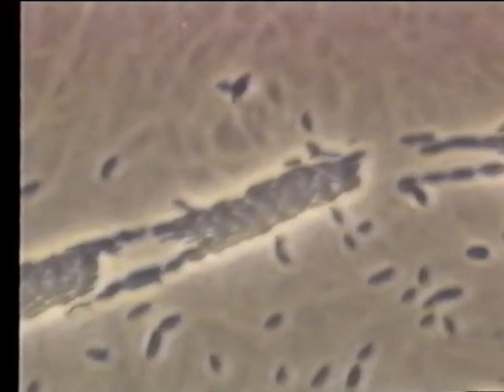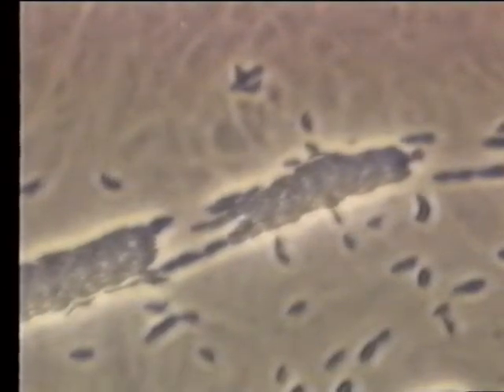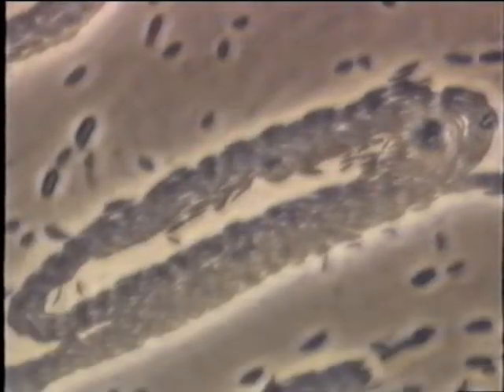These films were taken in slide culture. Now you can see there are some cells that weren't moving before at the bottom that are moving now. They tend to move in groups, as I say, and here they're moving in circles, which is also common for myxobacteria. They tend to move in groups in circles, in circular motility.